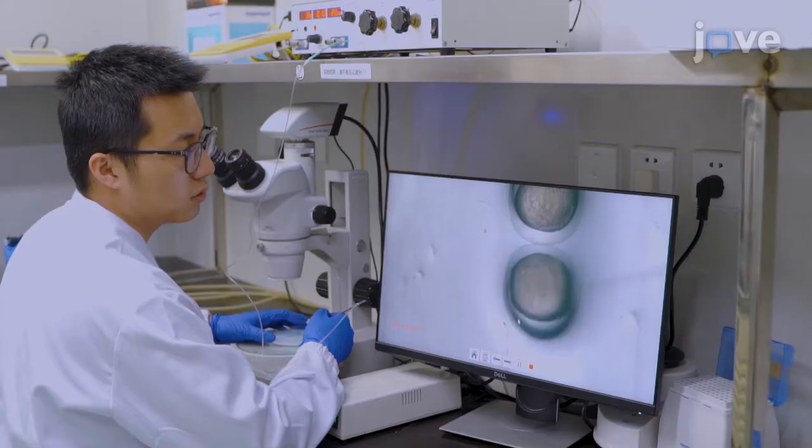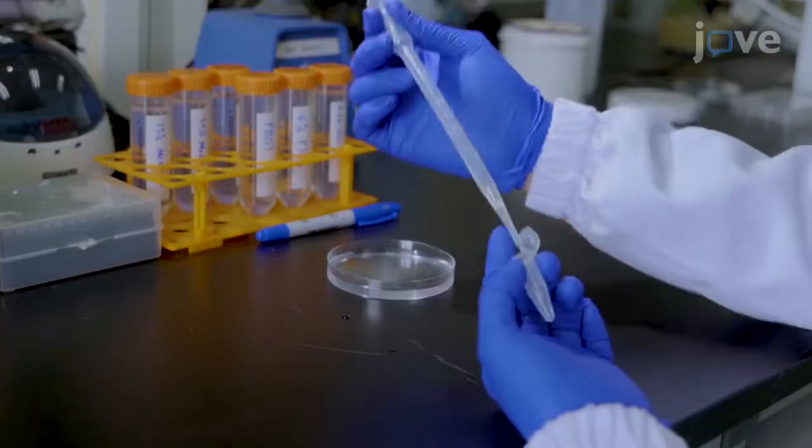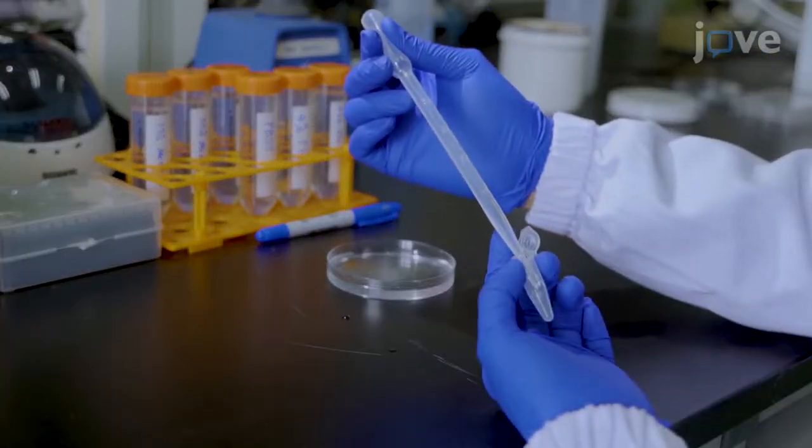Whole-mount in situ hybridization (WISH) provides high resolution and low background results compared to traditional methods. Also, use of slide plates improves the focus by using less Matrigel. WISH can be applied to mouse embryos, Drosophila embryos, and other tissues that are difficult to handle.